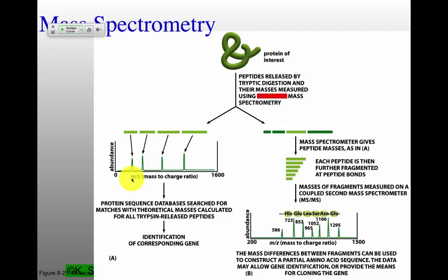And using those peptides and those masses, you can now compare them to databases of, for instance, all of the human proteins, or all of the E. coli proteins, or all of the Sulfolobus proteins that you're interested in looking at. And through that process, because these are so precise, you can literally absolutely identify whatever protein it is that was in that spot on your 2D gel, or the protein that you're trying to purify and you hope is that virus protein that you've been working on for years in the Stedman lab. So that's really the process.